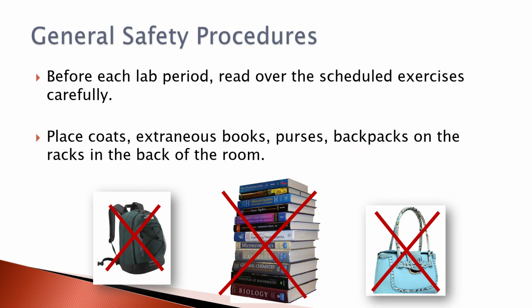Before each lab period, you should read over the scheduled exercises so that you know what you're doing. Place coats, extraneous books, purses, backpacks on the racks in the back of the room. Some colleges and labs don't even allow you to bring those in. They have lockers outside of the lab for you to put things, including your books, all those kind of things.